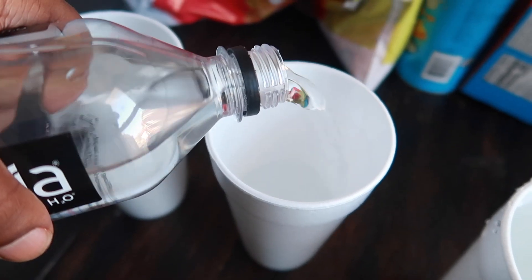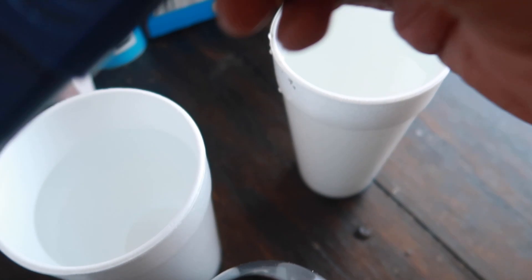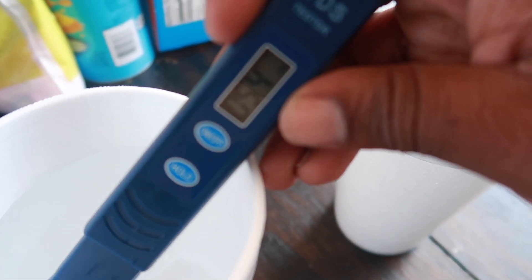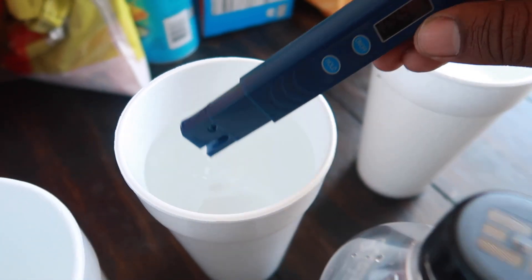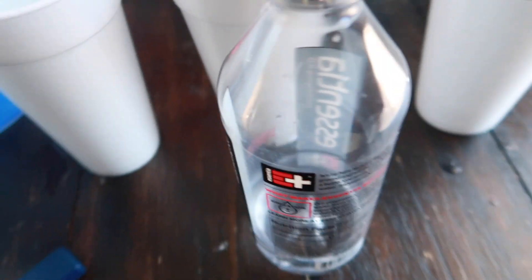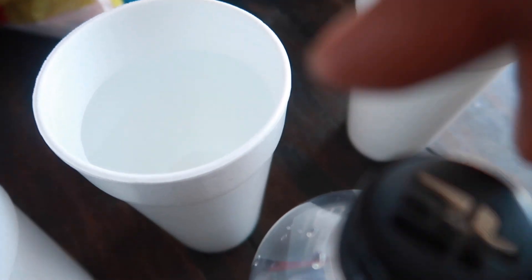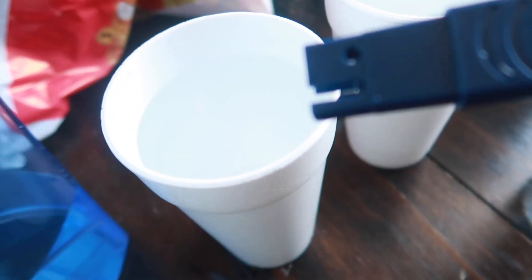Next we got the Essentia. We're going to test the Essentia — drop the TDS tester in. Wow, the Essentia is coming in at 54 ppm. So the Essentia does have dissolved solids. Even though this is a good water, it's not 100% purified — that's crazy just to think about.